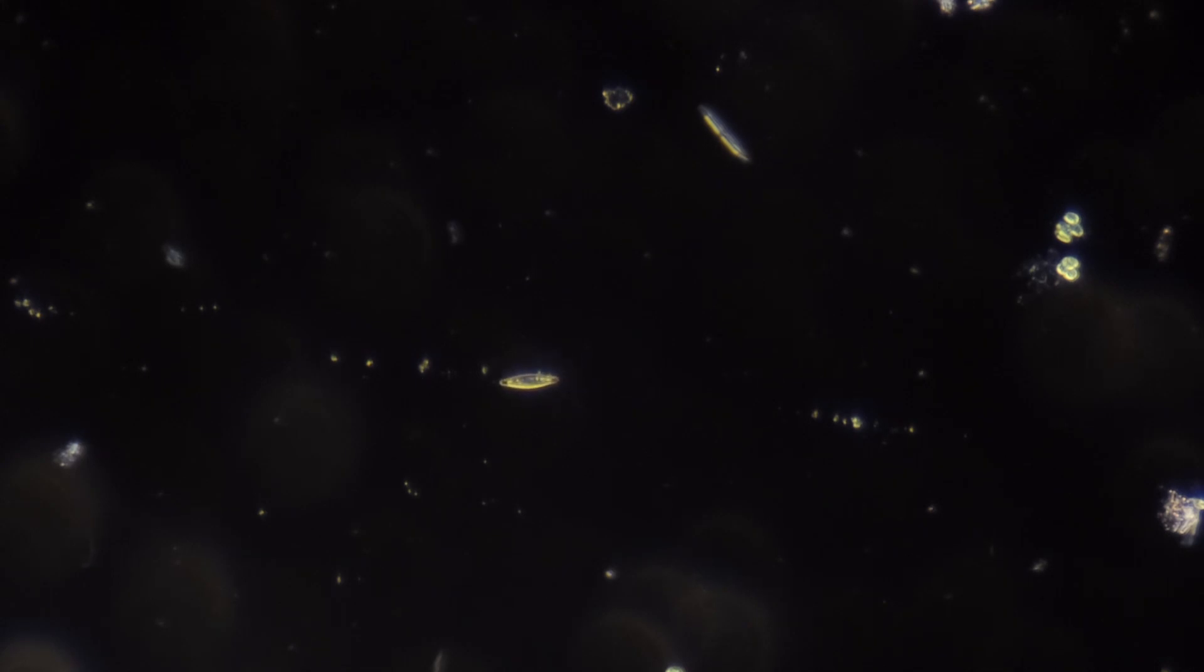I think, because if you look above and to the right, you can see another diatom, which is not mobile, and some nearby algae, also not mobile.